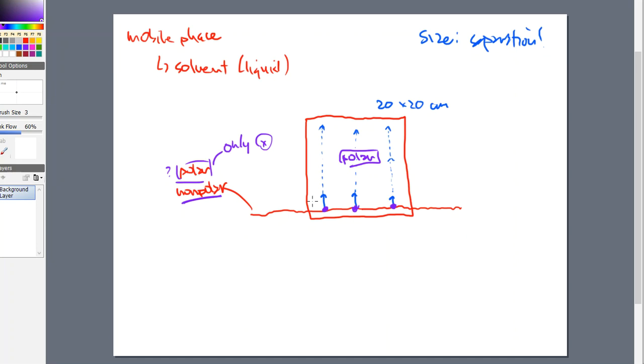And that's because these compounds are constantly choosing between the two polars that they want to be with. And I don't really get good separation like that sometimes, all right? If I choose only nonpolar, I don't get good separation there either most of the time. And the reason is because these compounds will look at nonpolars and say, I hate you.